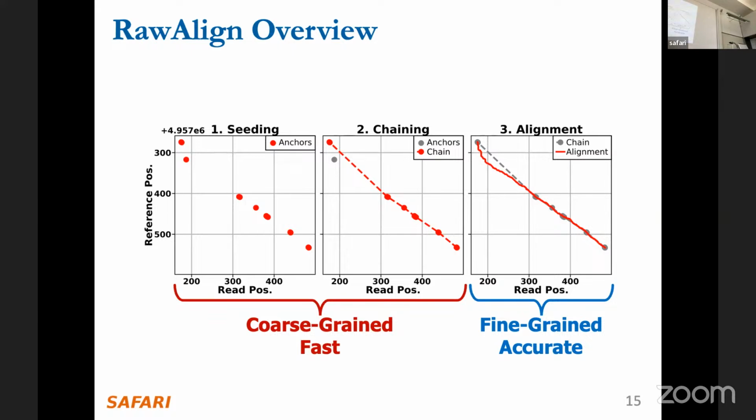You picked, okay, let's take this k-mer and look it up in the hash table. Here you ignore the contents of the read, and you just look back at that floating point array. You know where in that floating point array your seed, for example, came from. Then you can check whether the raw signals over there match or don't match the reference.